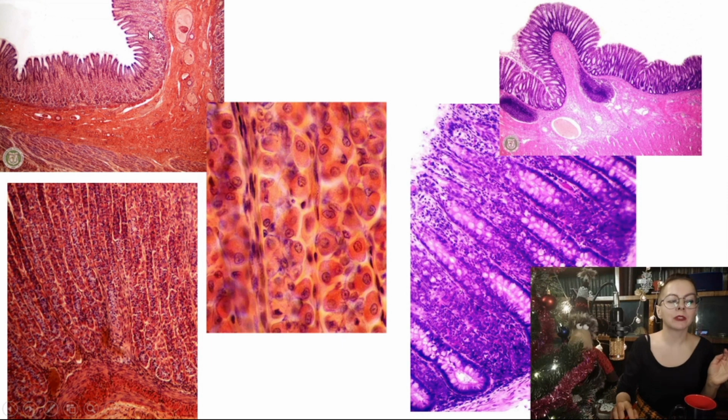First of all, this is the fundus of the stomach, and this is the colon or large intestine. You see, they look like each other. They are very similar, but usually fundus of the stomach is stained with shades of red with Congo red, a special dye. So they are red, while colon is usually purple and pink.